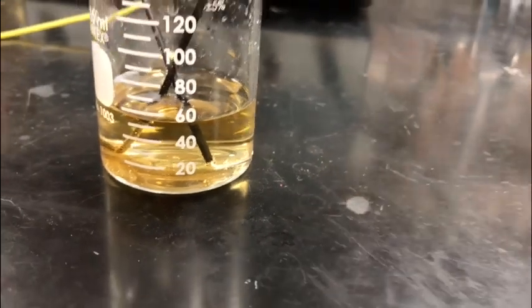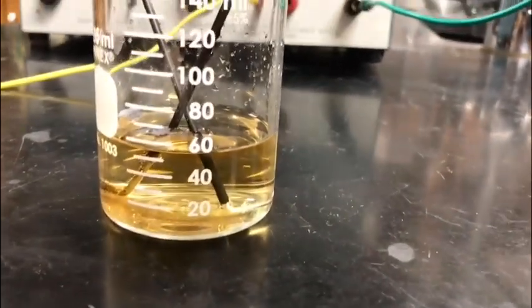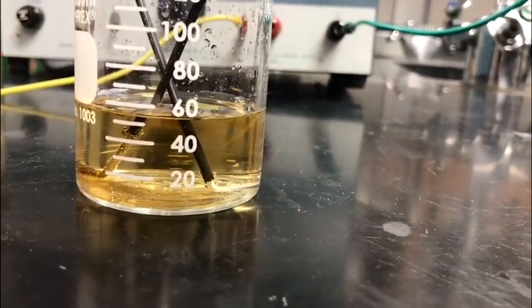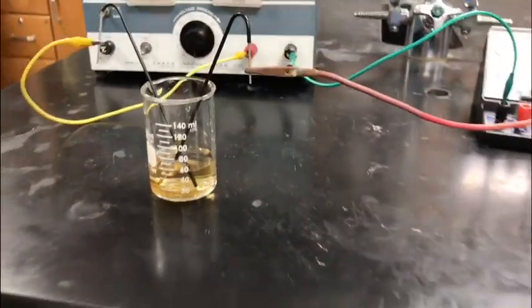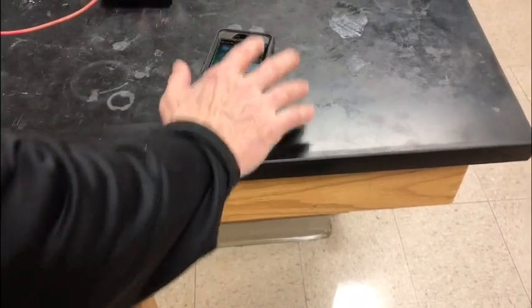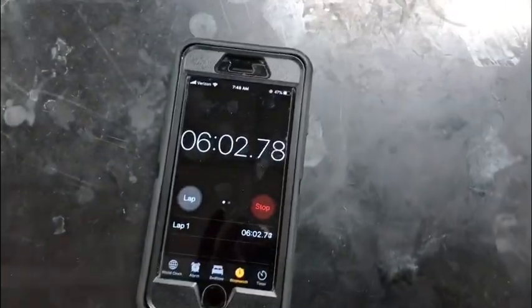We're going to let this rest now for another five minutes. We've done this experiment a few times and find that the results seem to be better if we just let it sit there for a while and not bother it. We'll be back in another five minutes after the rest period — the phone went to sleep there, but we'll be back.